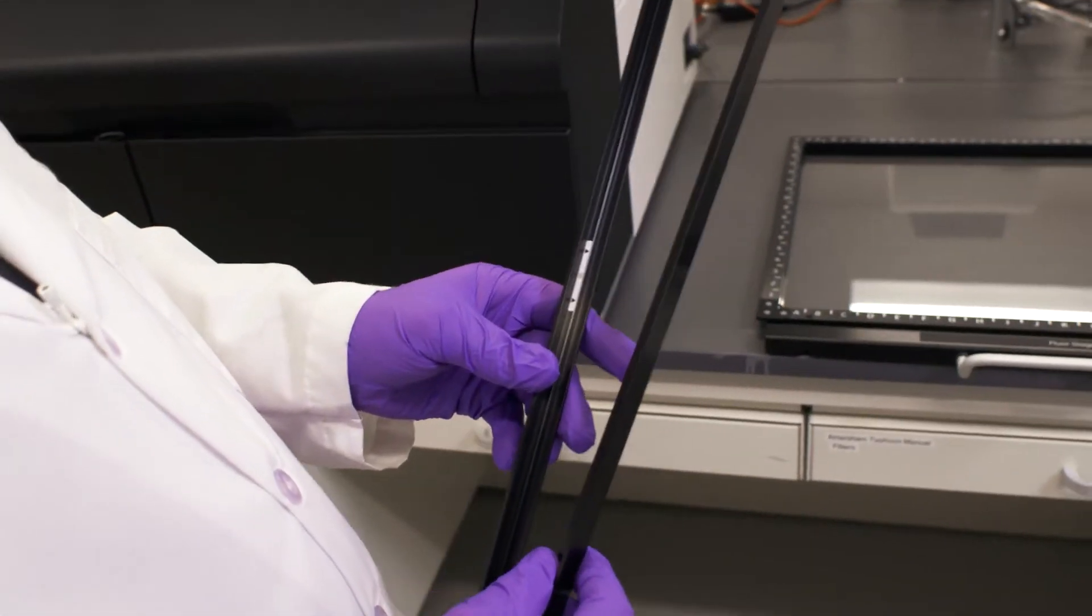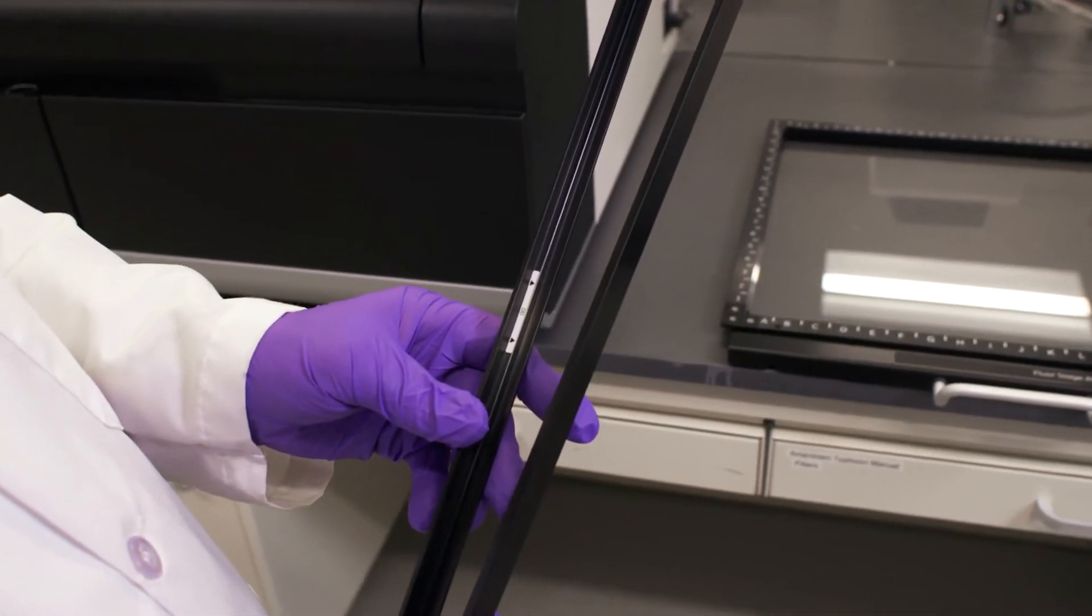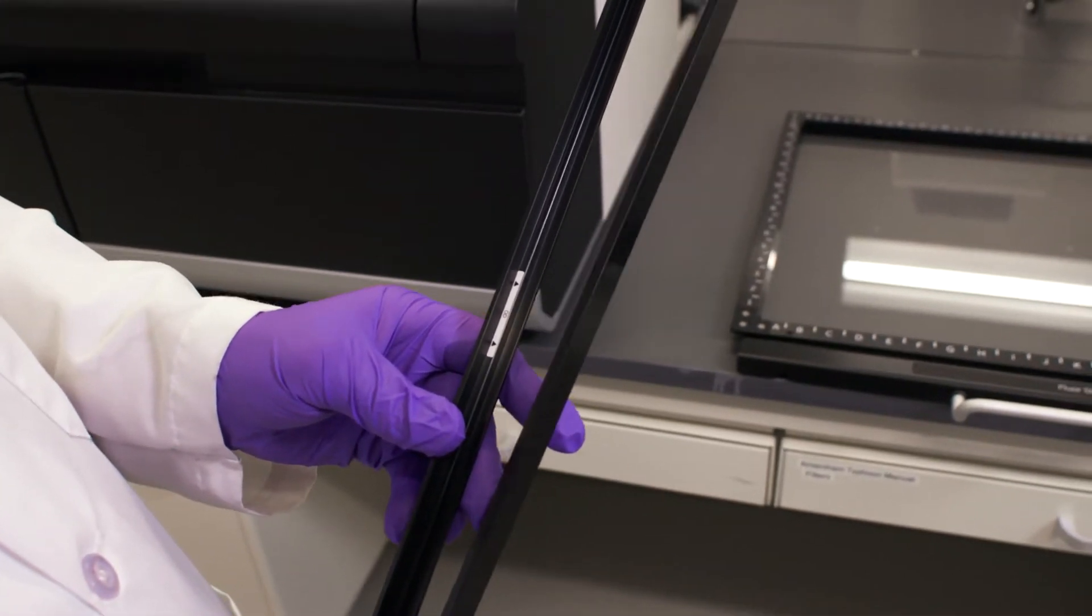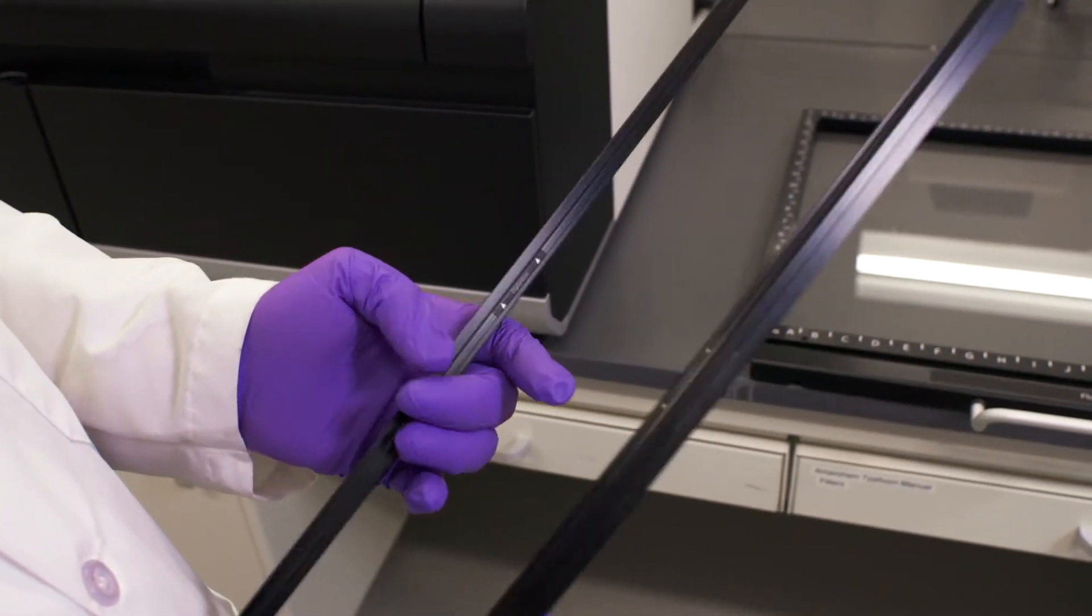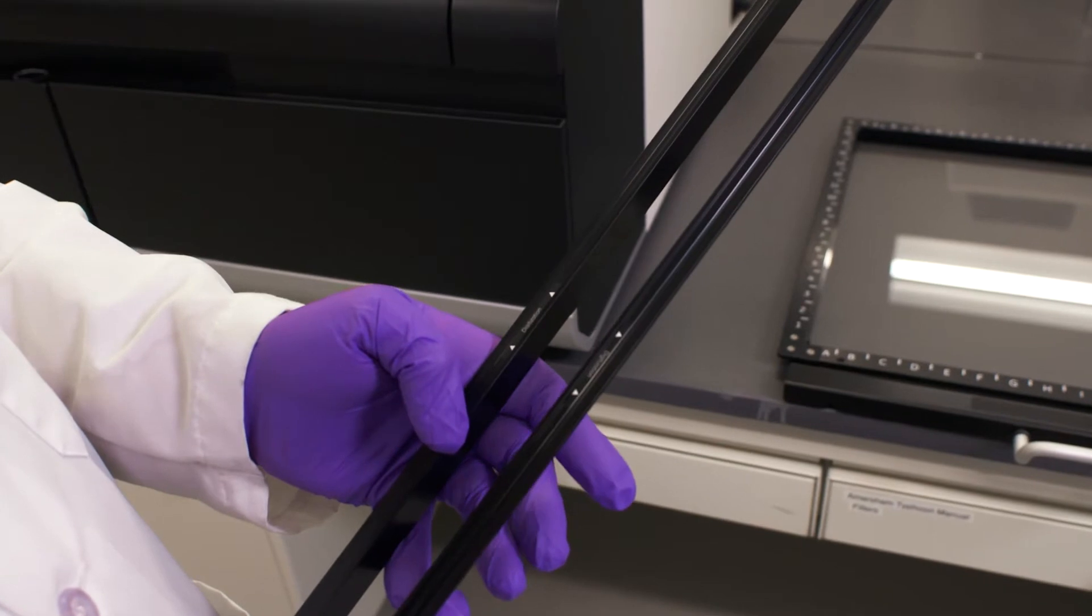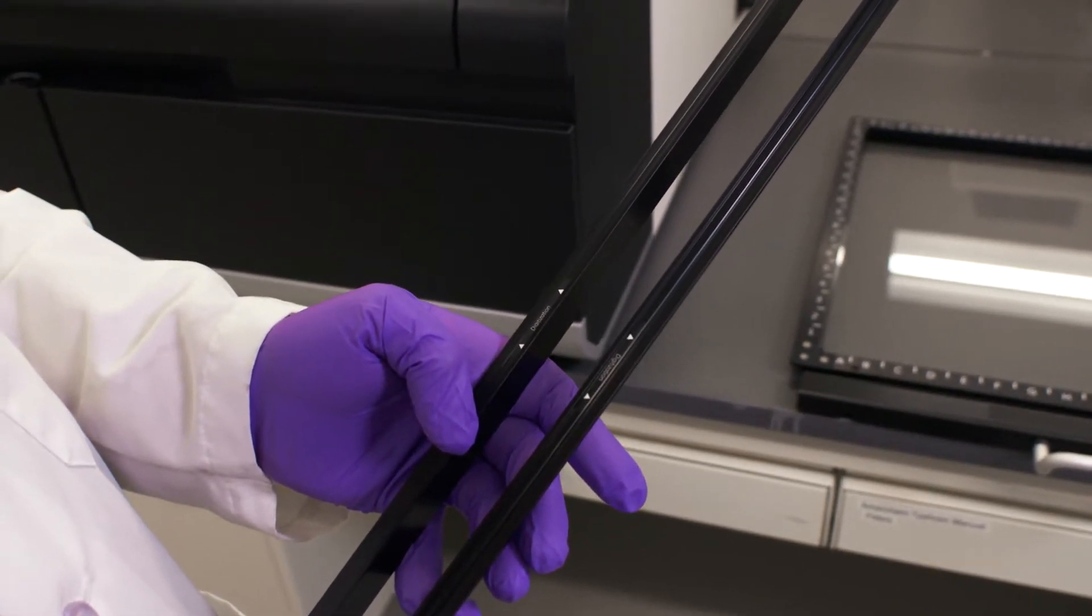We're going to need these two brackets here. In one orientation it says OD, so this is going to be for densitometry because that will measure in optical density. The other way around is for digitization, so this is really just for gel documentation.